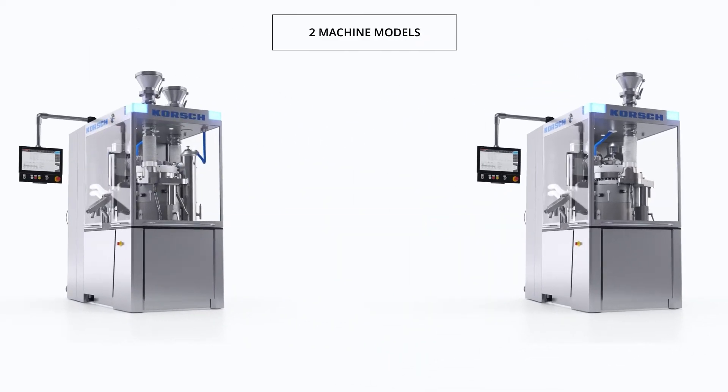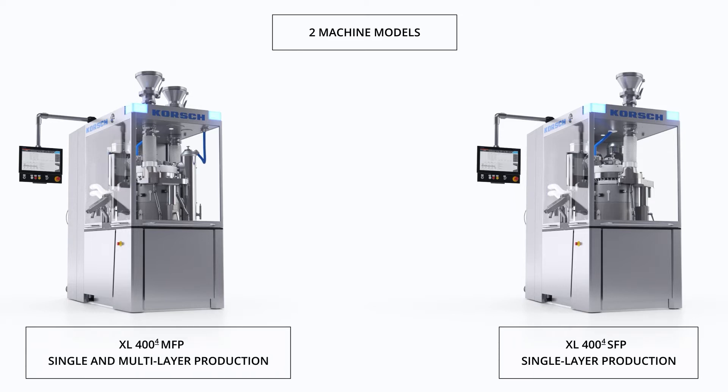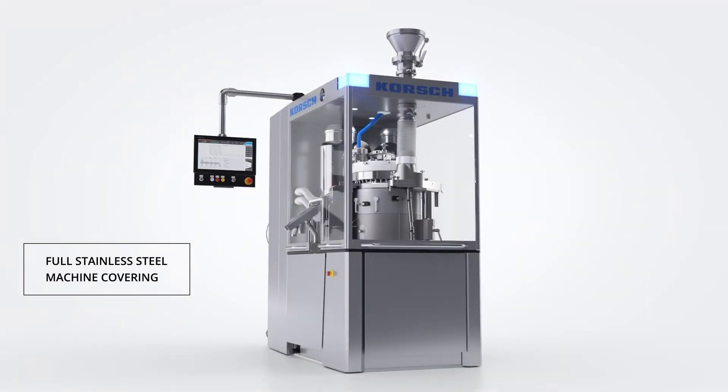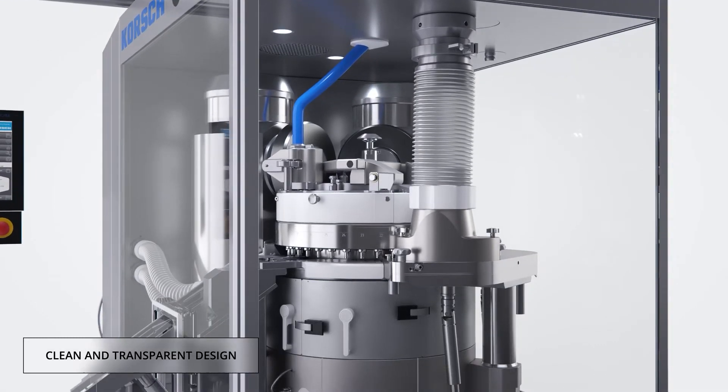The XL404 is available in both a single-layer only SFP model and a full flexible MFP model. The two machine models share a common platform and fully interchangeable components, as well as common procedures for setup, changeover and turret exchange. The XL404 leverages the combination of form and function to maximize performance.